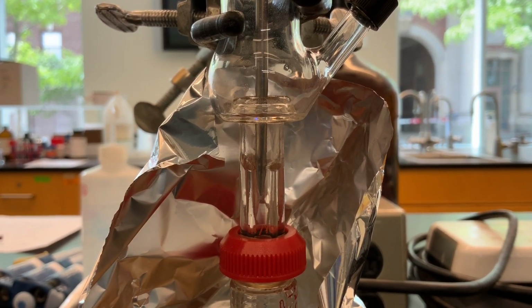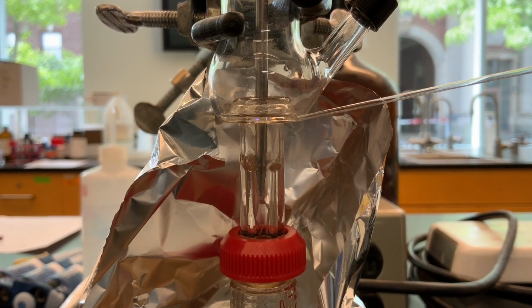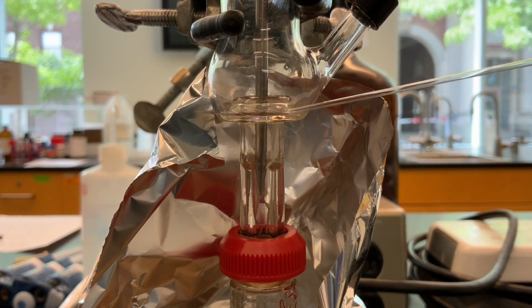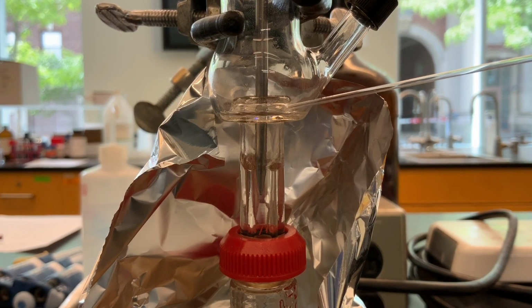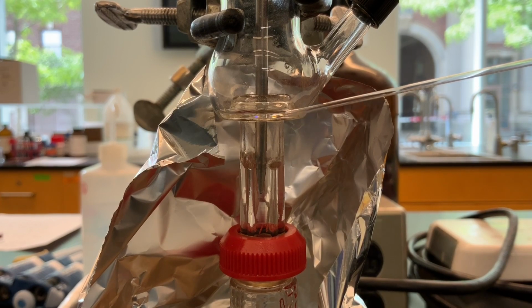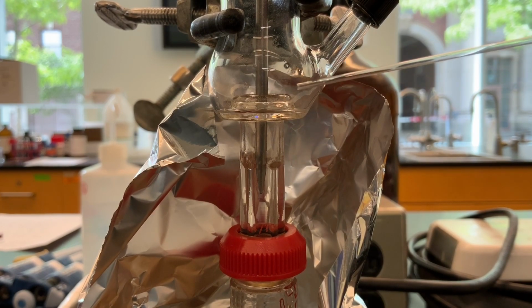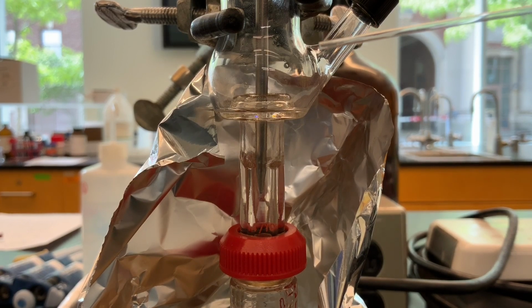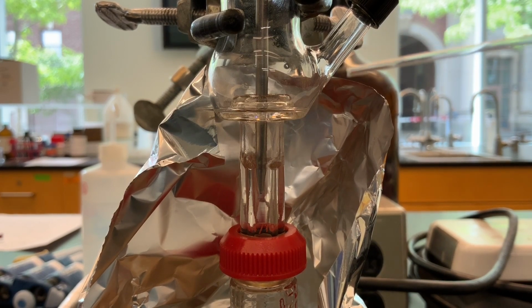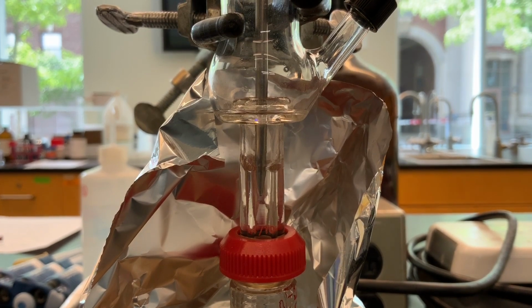And so obviously now we're just waiting for this liquid level to increase in volume, and we're going to monitor the temperature. So once we've got the maximum and then the temperature starts to decrease, then we know all of the hexanes has boiled or distilled off, right? Because our distillate should be 1 milliliter. And so we're still climbing. It's at 74 degrees right now.